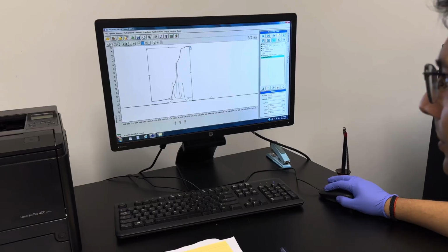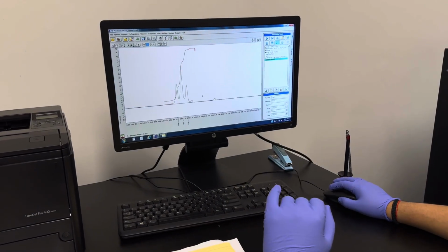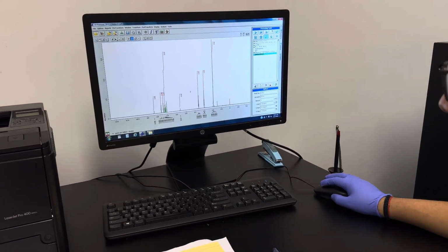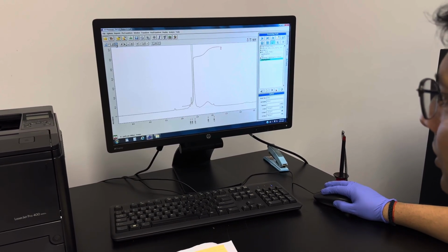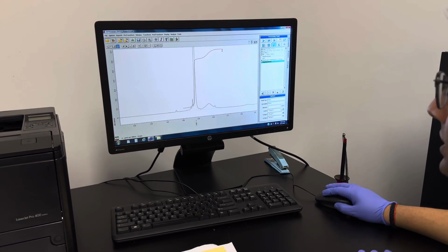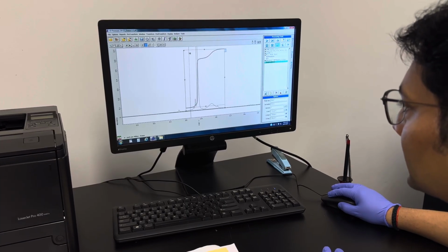So mainly the peak starts from wherever. I should cut this also, but cutting this is very difficult because it is very close by. So it's okay, it doesn't matter. 2.04, 2.05 to 1.95, all okay. Nobody will bother for that. Go and the last one. We'll remove some extra peaks, whatever they are. And then focus on this because the bigger peak is the actual peak, and we don't want all the way. So again take the scissor and cut.